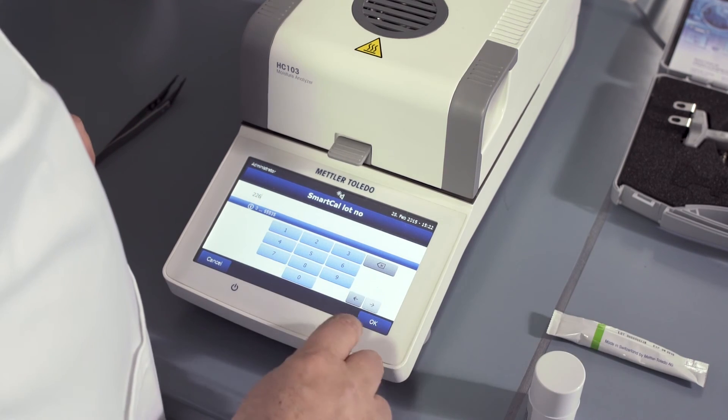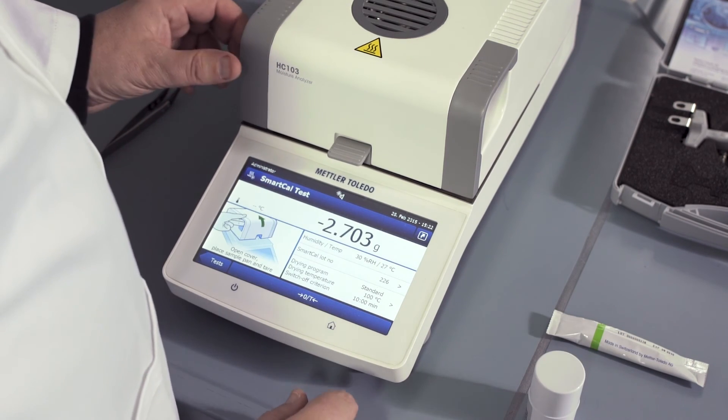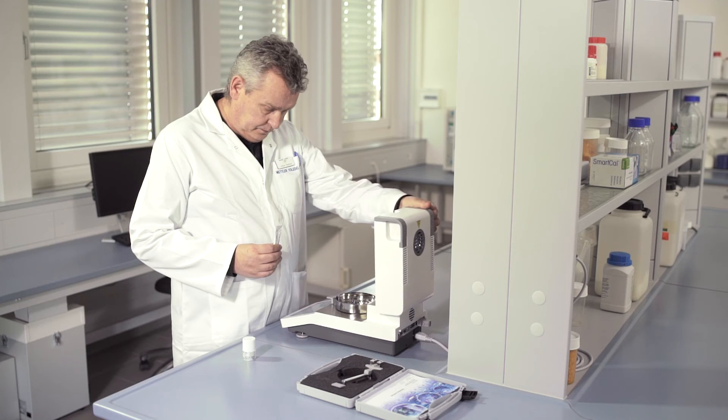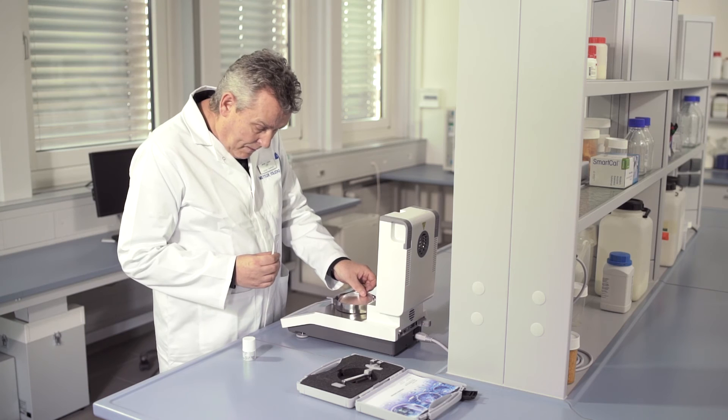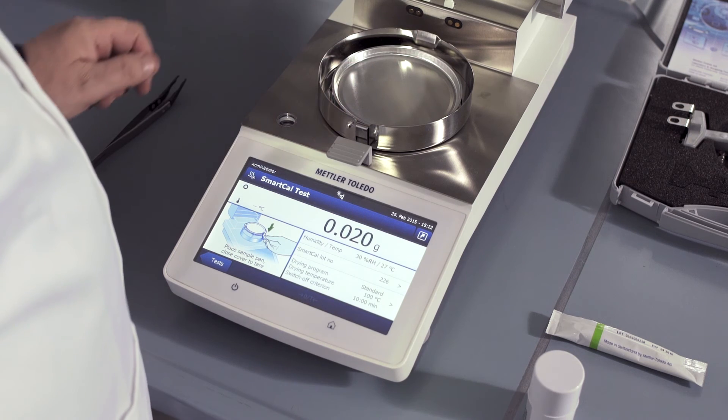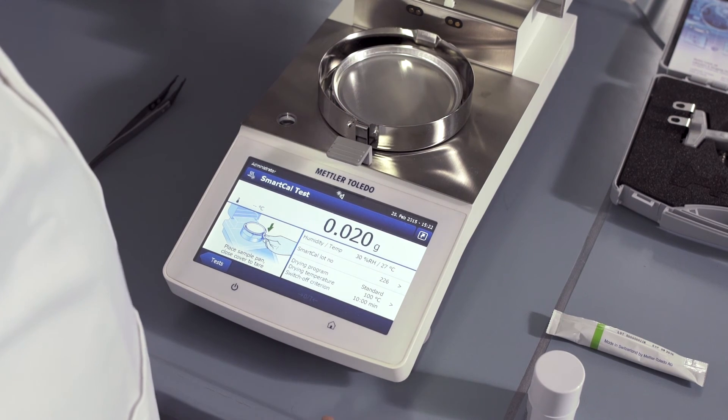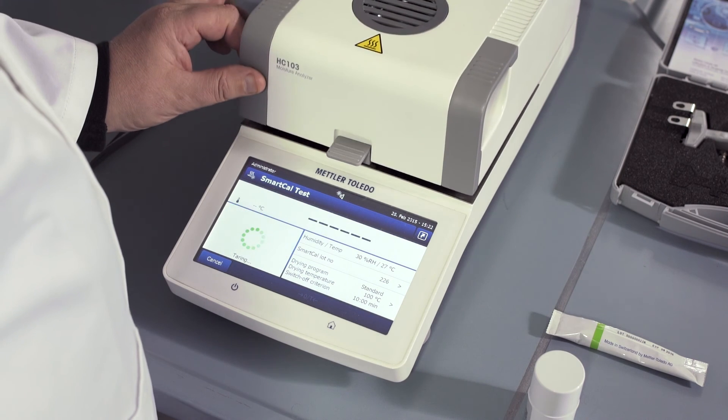Then proceed as with a normal measurement. Open the lid, place an empty aluminium pan, and close the lid to perform a tare.